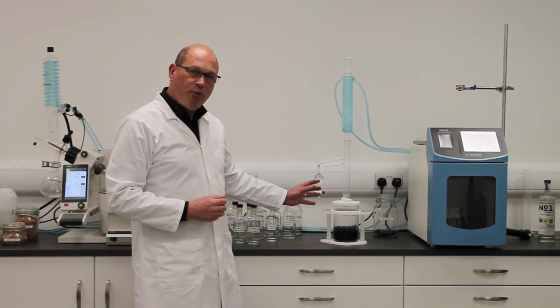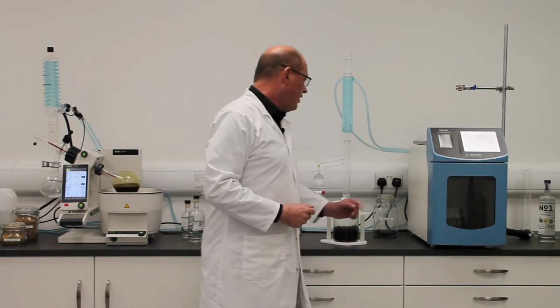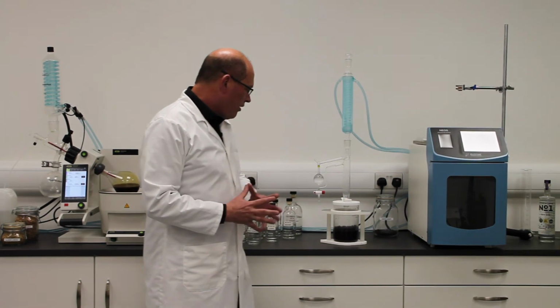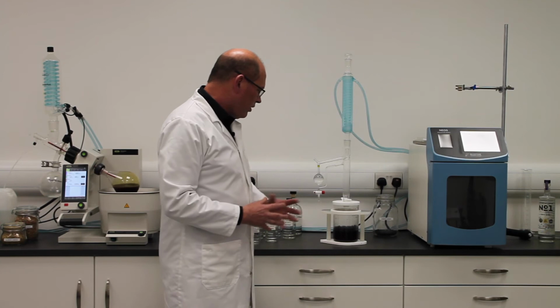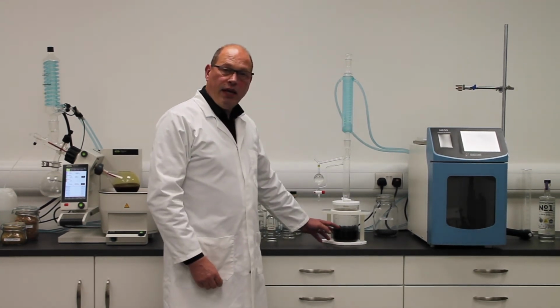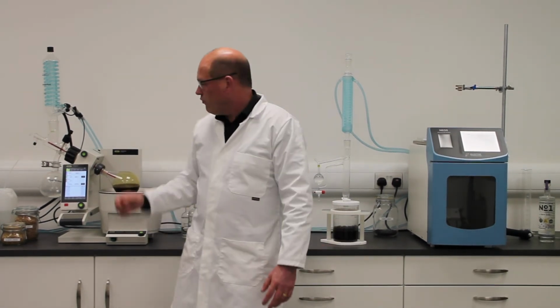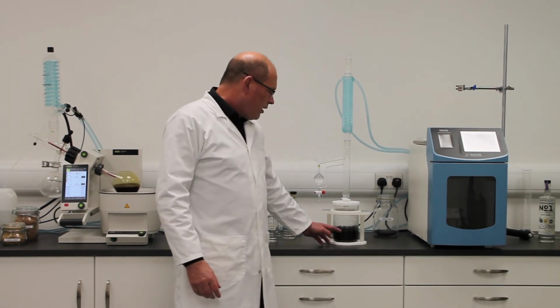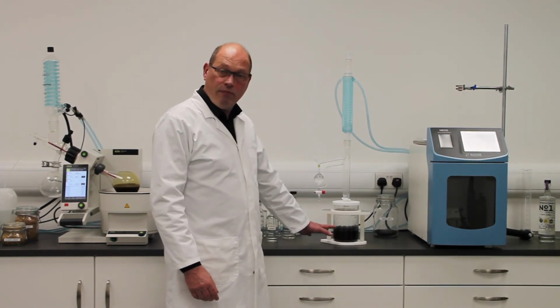So I've taken the apparatus out of the microwave, so it would normally sit in here, and there's a chimney out there that this comes out of, but it's good to show it all clearly out on the bench here. So we've got in here, I've put dry juniper, the same amount of juniper that is in here. And what I've done is I've heated that with the microwaves.